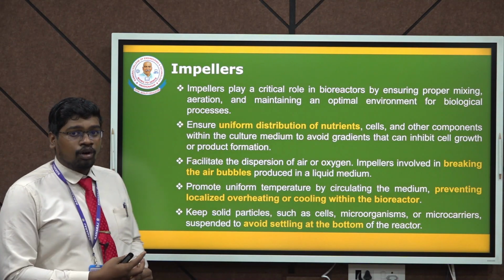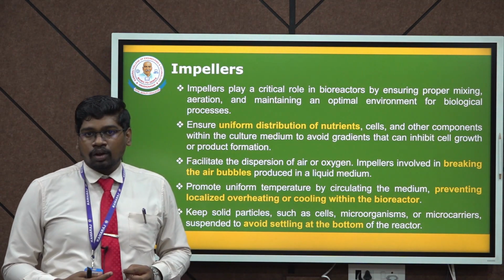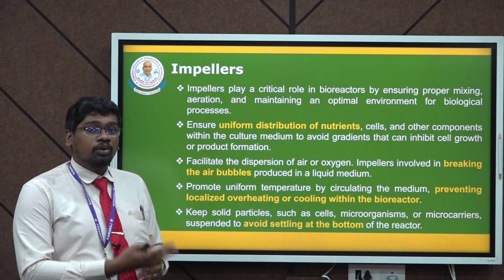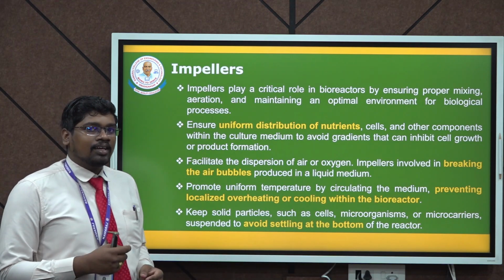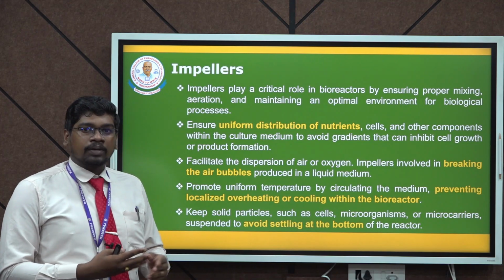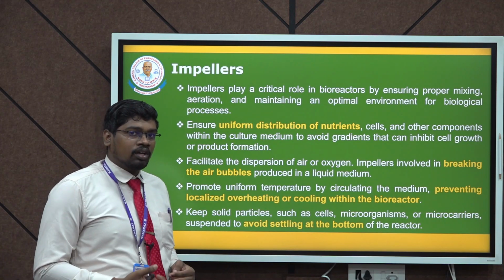Impellers are important for the mixing of the contents of the bioreactor. Inside the bioreactor, the nutrient media is present to provide nutrition for the microbial cells, and the oxygen and air bubbles are present to provide the aeration for the microbial cells.